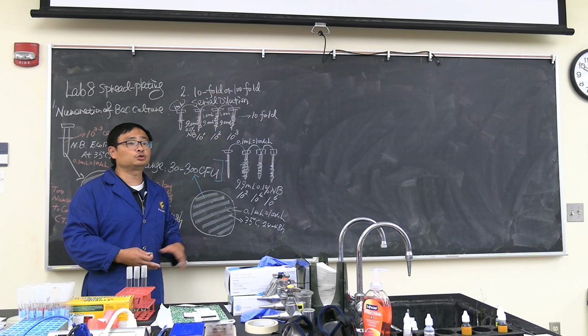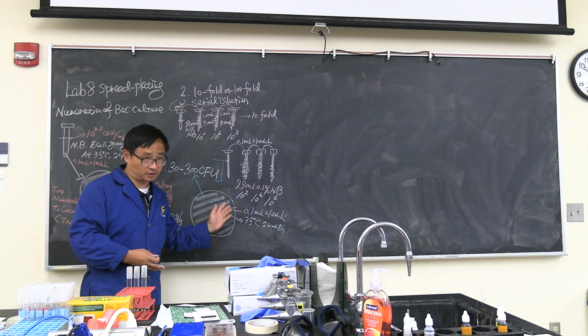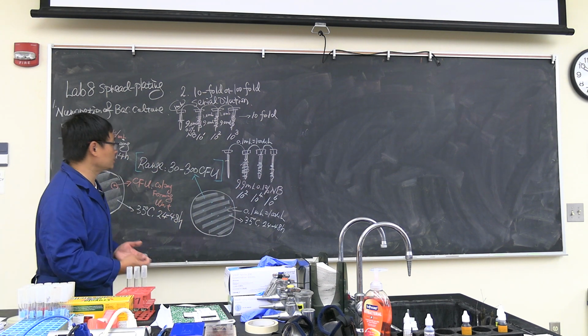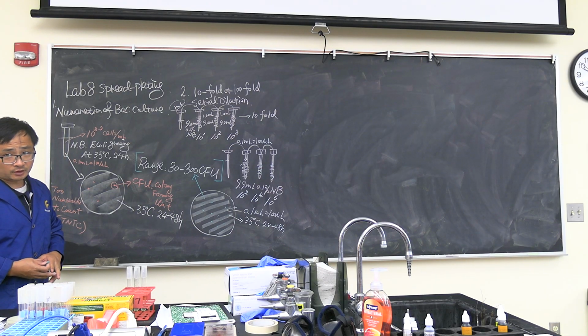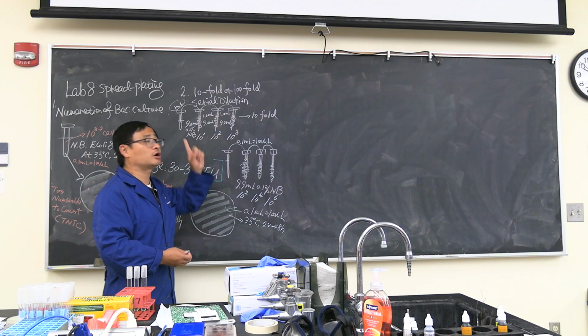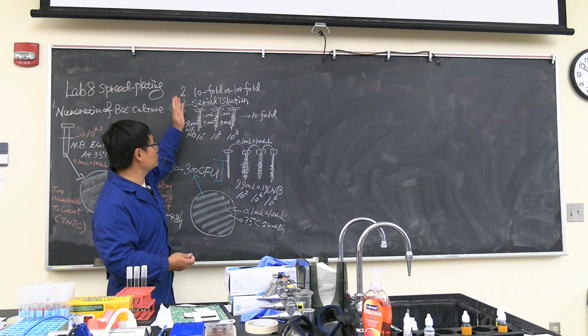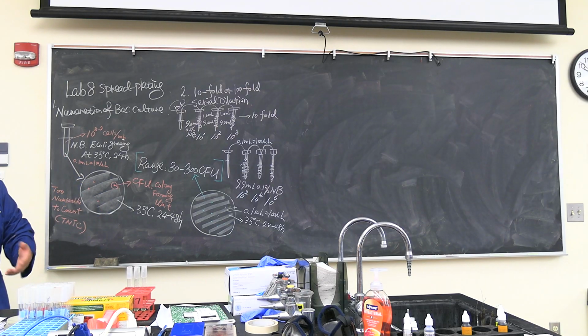Third, we are not only going to rely on plating at one place. We usually need to do multiple dilutions, and every dilution factor we need to plate, because we want to pick the one which fits 30 to 300. If you're only using the highest dilution, maybe it's only one colony there. If you're using the lowest dilution, maybe it gets 400 CFU, then it's too numerous to count. So those are the two important things before we do this.